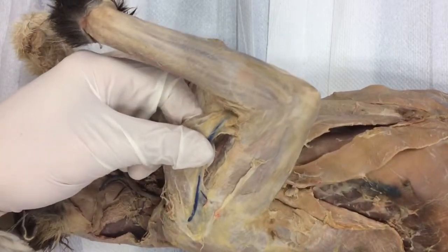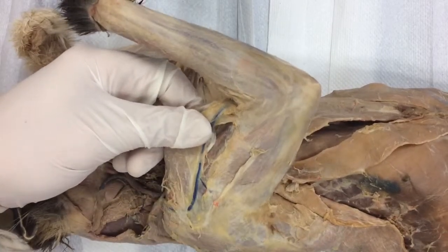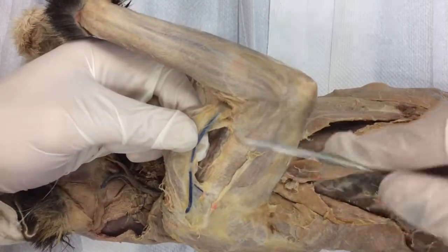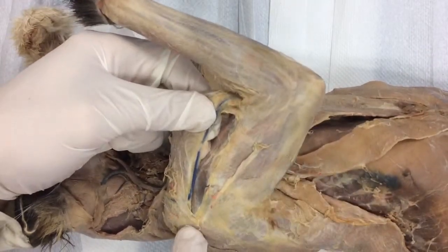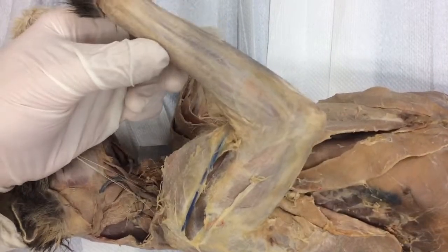We're going to take it — it actually attaches to the clavicle right about there. Now I'm going to take my scissors. Here's the rest of the line — just like paper. And then we're going to stop right there where it hits this next muscle. That's about 95% done — that took literally 30 seconds.